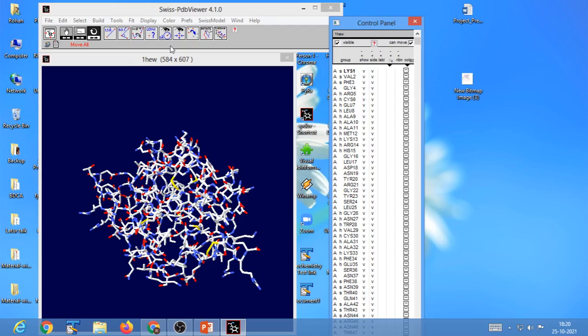Your protein molecule can also be shown in surface representation, but discussing surface representation is way out of scope of at least this tutorial. Maybe I will create another video for analyzing surfaces of the protein. So stay tuned to my lecture series.